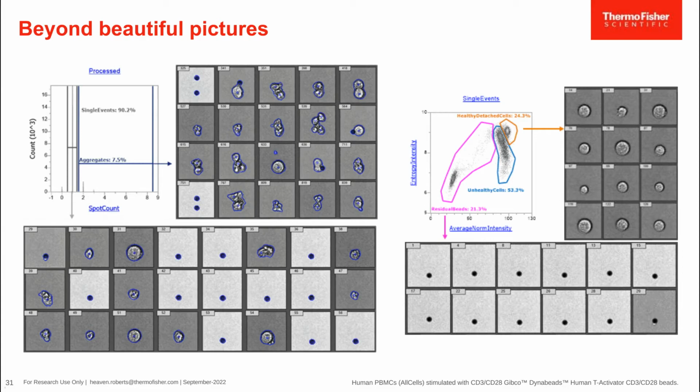The unhealthy cells that are that intermediate population, I'm not too worried about those. If I lose them in my debeading assay, they were already going through apoptosis or necrosis. And again, I can see that using some of these extracted parameters, as well as, of course, viability and annexin V staining.